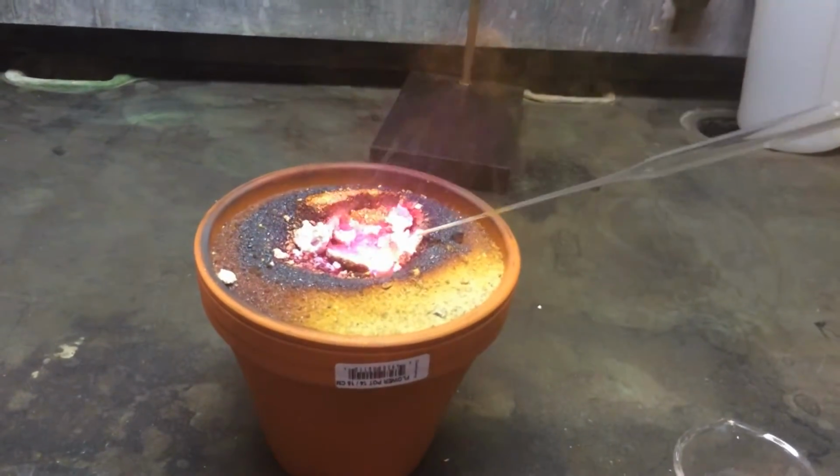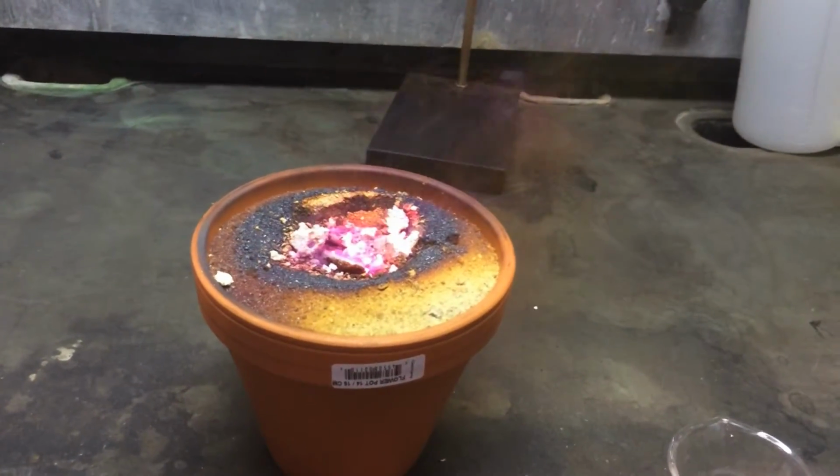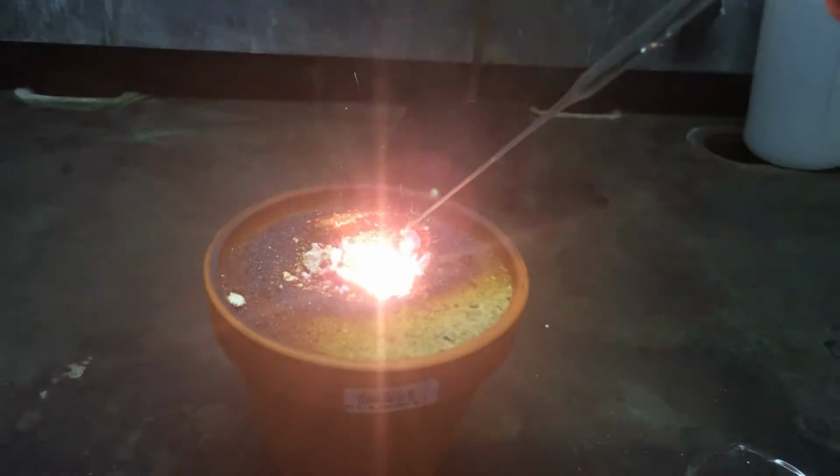Now there is another thing that I can show you here. This is one of those times where you don't want to try putting it out with water, because that just makes the reaction go again.